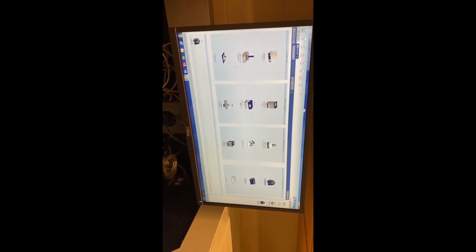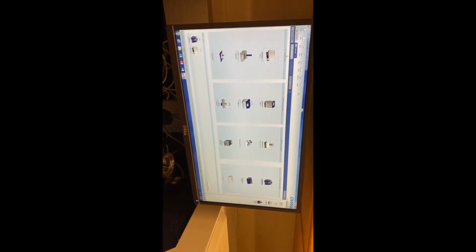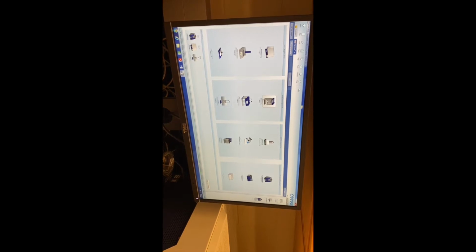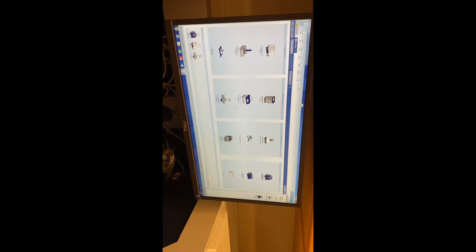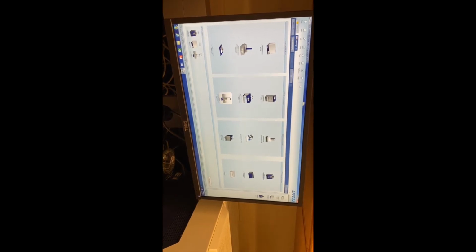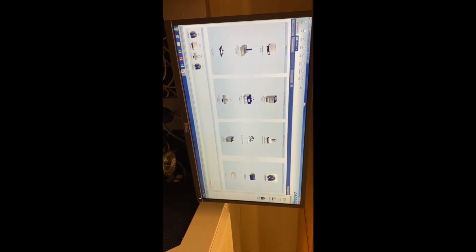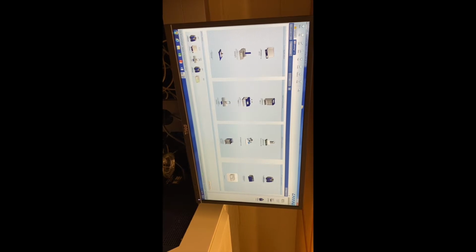So after this, we're gonna apply the samples to the plate, which is this one, and then we are developing using a chamber. We have this instrument, but this one is not connected to the computer, so we have to use this one. And then I use this to take pictures again, and then use the scanner 3, which is the one we have, and then to scan it.